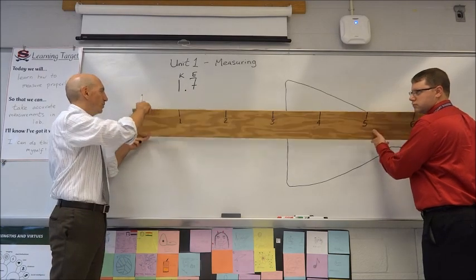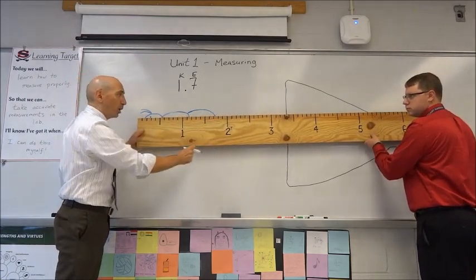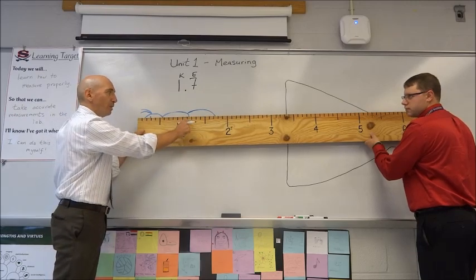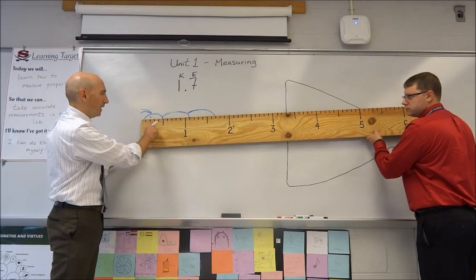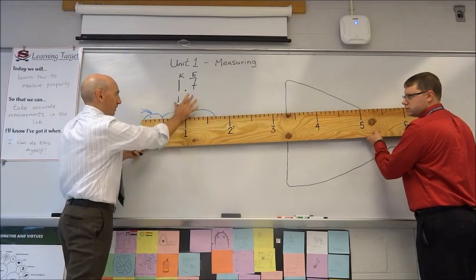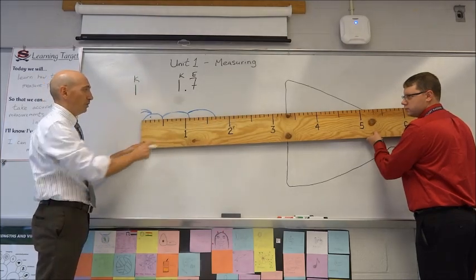Now if I flip this over, I have a ruler that looks a little bit different because it's got the units, but it also has tenths of a unit. These aren't feet and inches. These are the units plus tenths. So again, I'm going to put the 0 mark, the end of the ruler, here. And again, I know that I have 1 unit. That's a known digit. I know I have 1 unit.